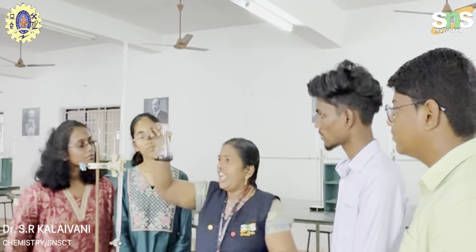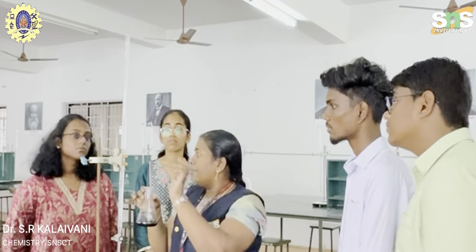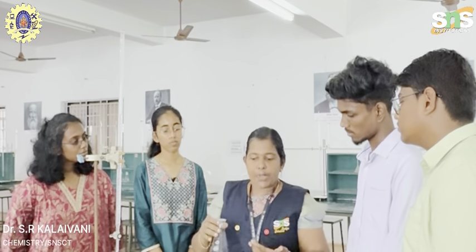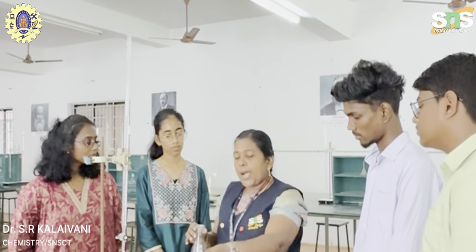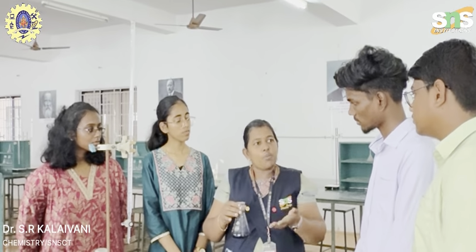Look, this is our endpoint, steel blue. So wine red color changes into steel blue. This is our endpoint for titration 1. So what is the reason for wine red turning to steel blue? The reason for the wine red color is the presence of calcium and magnesium salts combined with the EBT complex. When EDTA solution is added, it automatically forms a complex.